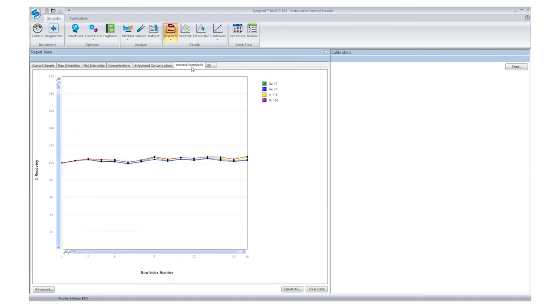For ease of exporting and further data review, there is an Export All button at the bottom of the screen that will export everything you see in the reporter to an Excel file.